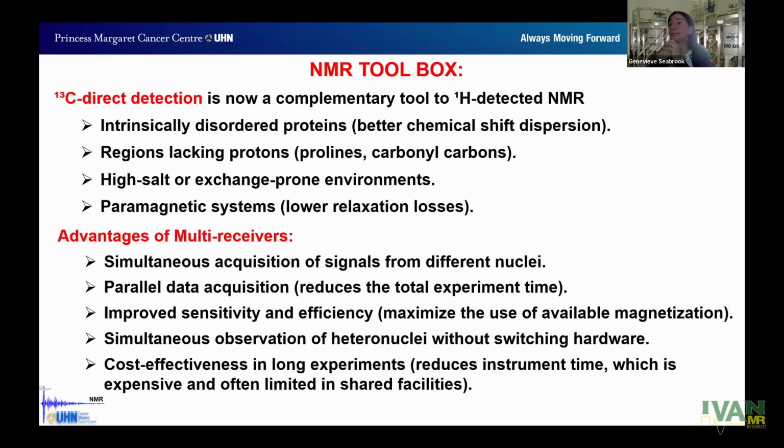So just to go back to the beginning, this was really about how NMR managers, we're super busy. We have lots of tools in our core facility or NMR center. We have lots of projects, and we don't have enough time to explore everything. But this one was a beautiful demonstration as to which instrument you should be using, an 800 because you need dispersion. Which probe should you use? Of course, the one that is optimized for carbon.